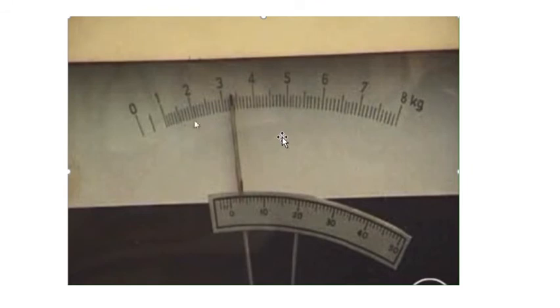Now the movement of the beam and the pendulum was there after the movement, after the break of the fiber also. But the load scale has stopped and the elongation scale also stopped after the fiber sample has been broken. This is the load scale and this is the elongation scale. As I already mentioned, the elongation scale will be moving, whereas for the load, the pointer will be moving.